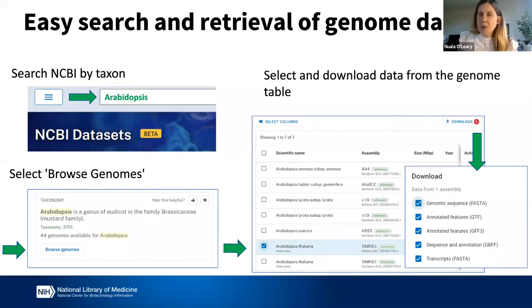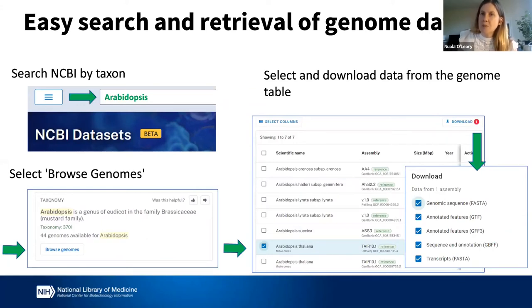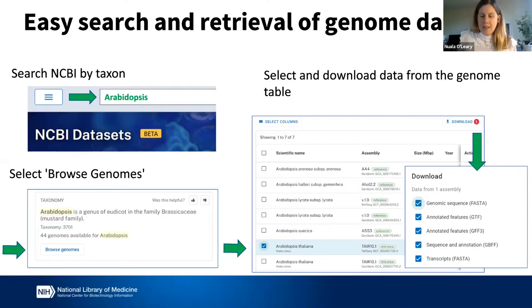You can also filter the table down by several properties. Once you've selected the dataset that you want, you can select the download button, and it will give you choices. A genome dataset is a complex set — it has sequence, it has annotation, and files in different formats — so you can select the file formats that you need and download the data.